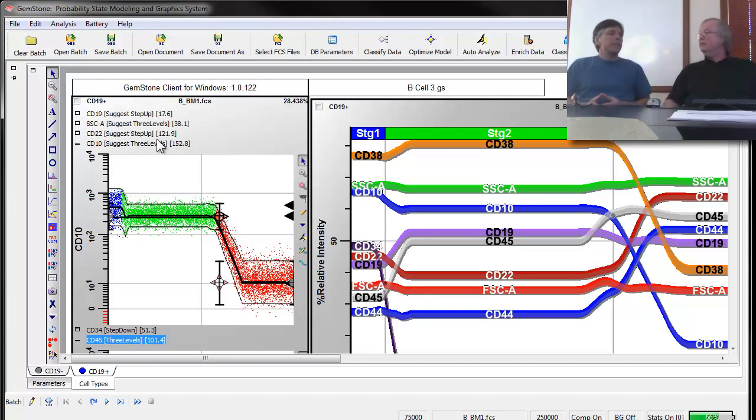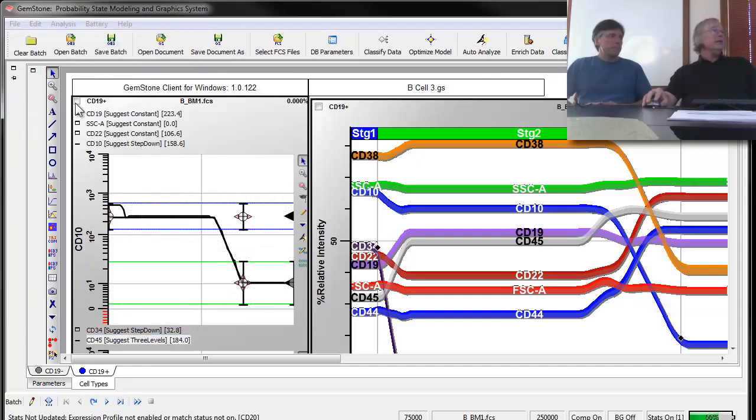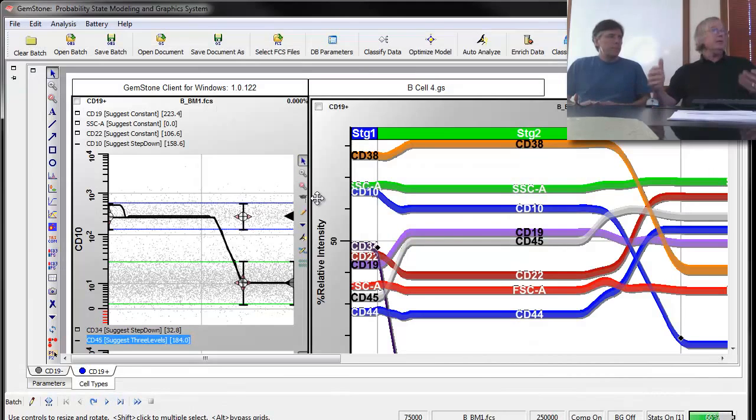We've got a few other things to do to make this work, but at this point we'll go ahead and save that model. So we'll click on File, and normally what I do, Ben, is I hit Reset before saving, which puts everything back into the same state it was in when we loaded the template. Right. And then I'll go ahead and save template, and like we have been doing all along, we want to increment the version and save it. Yep. So at this point, template's ready to go.